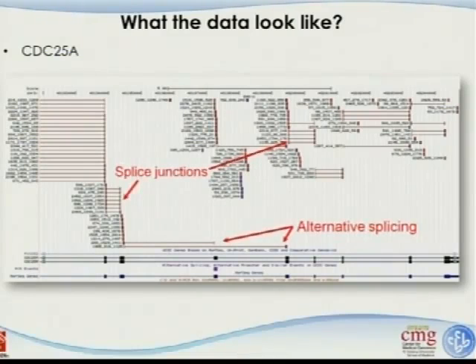And we see many reads that span junctions, so-called junction reads, meaning that for a particular read, one end is in this exon and the other end is in that exon. Bringing this together, we see an interesting alternative splicing event, and this read gives us evidence that these two exons are joined, and splicing occurred in this way.